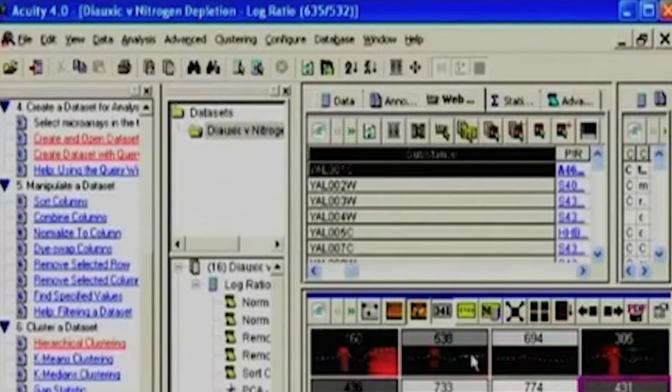The idea comes from the hierarchical, but as you see here, the clustering gives an immediate response: okay, this was very low in these ones, again it went down, and you are able to see it again up. So in different time codes it's a different expression. Correct. So based on the behaviors you can see that this is being grouped up with.